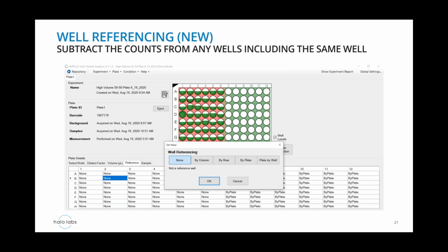One other advantage that we have compared to manual membrane microscopy is there's actually quite a bit in the chapter on what cleaning these membranes looks like. But honestly, those chapters were written decades ago, before there were even CMOS cameras in the way that we have them now. You can literally do a well by well subtraction, so you don't really have to worry too much about what was there in advance.